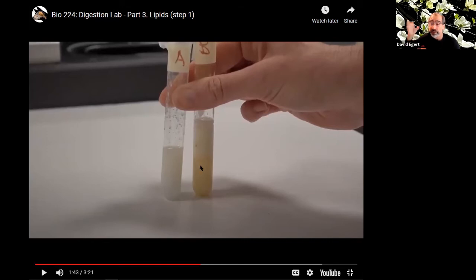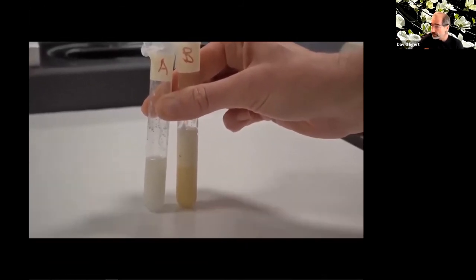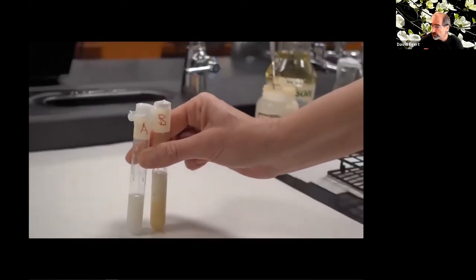Detergents act in this exact same way to get in between the oil droplets and the water and suspend the oil into the water stream so they can wash away. Otherwise, you would just pour the water over a greasy plate and the grease would just stay stuck to the plate. It would never leave the plate. But detergents get in between the oil and the water and allow the oil droplets to get suspended up into the water and flow off and leave the plate sparkly clean. Which we would expect to happen in A, but let's see what happens in test tube B where we added the bile salts.